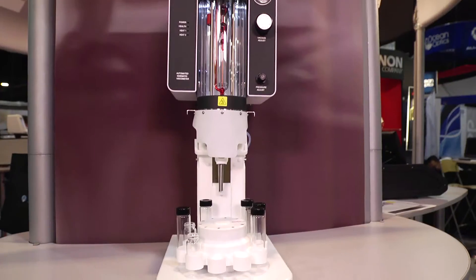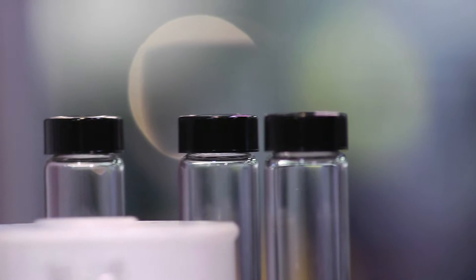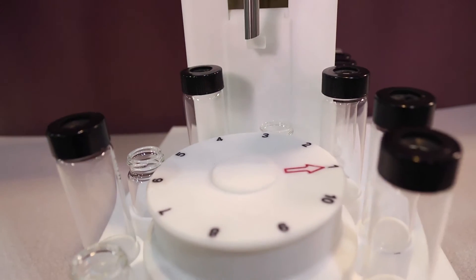It has a ten position sample tray which will allow you to test unattended, and it will accommodate any ISO and ASTM polymer methods.